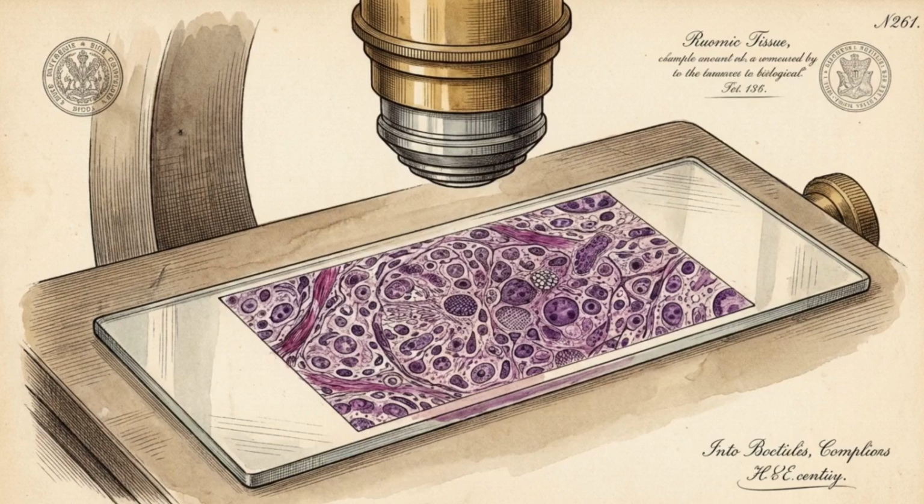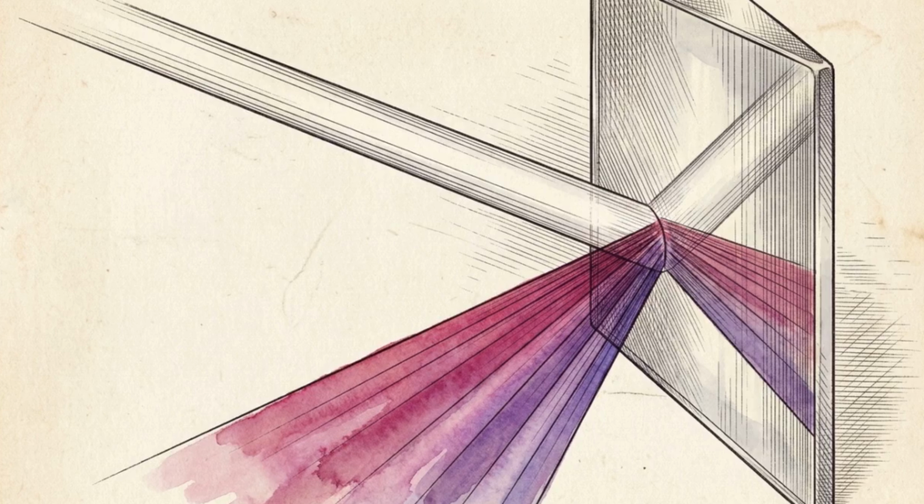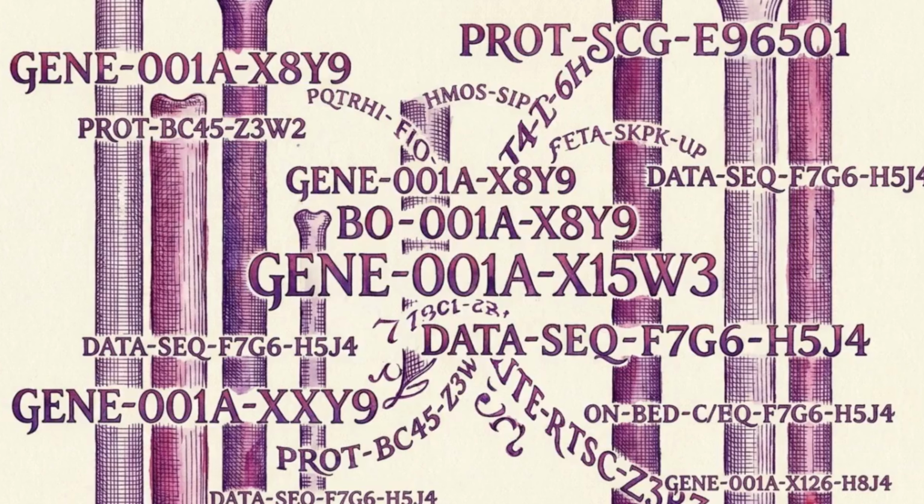Successfully running a tissue slide and generating optical data is only the first step. The true bottleneck in spatial omics is post-experimental computation. The hardware outputs raw pixel arrays. It generates raw optical reads and records specific barcode coordinates. These data points have no biological context without spatial boundaries. This requires cell segmentation algorithms.